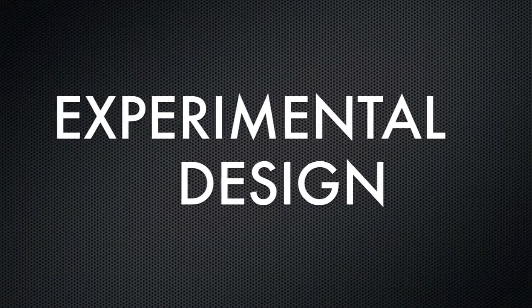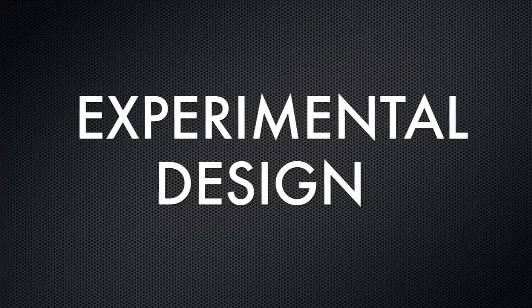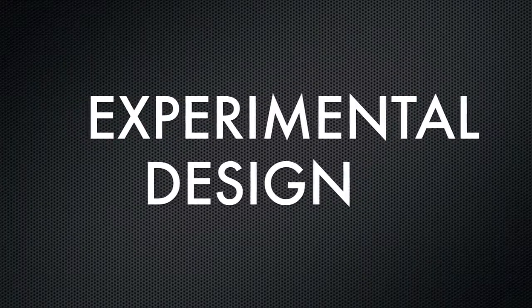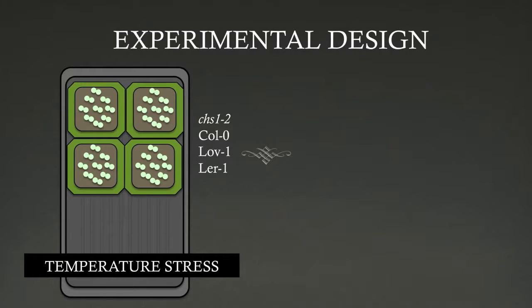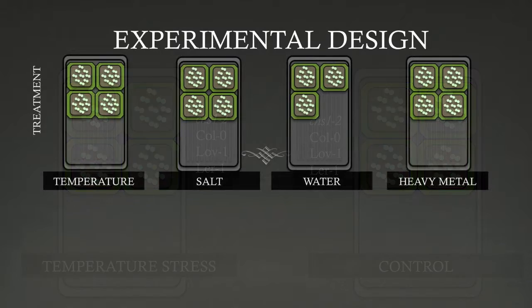Because this is an advanced module involving multiple experiments, some consideration to experimental design should be given before starting. Each experiment in this module requires the planting of multiple seed types and also requires growing both an experimental treatment tray as well as an identical control tray, which will not undergo any stress and will be used for comparisons at the end of the module.